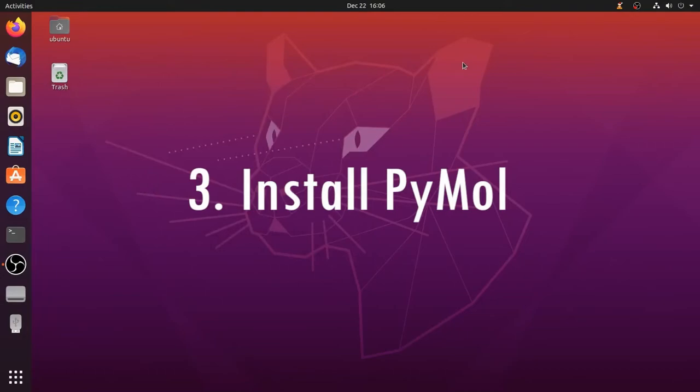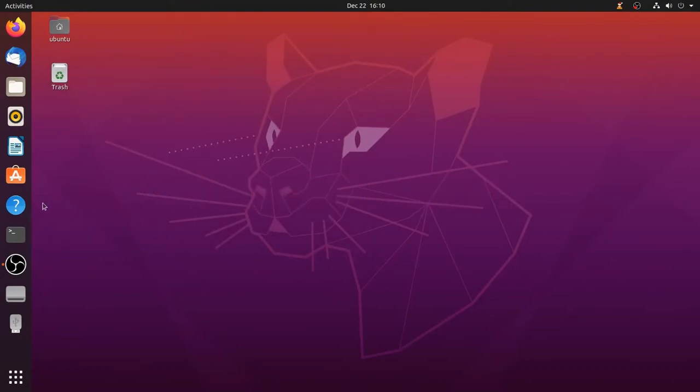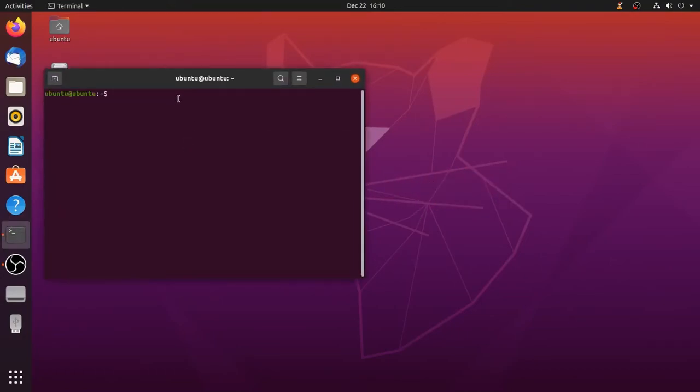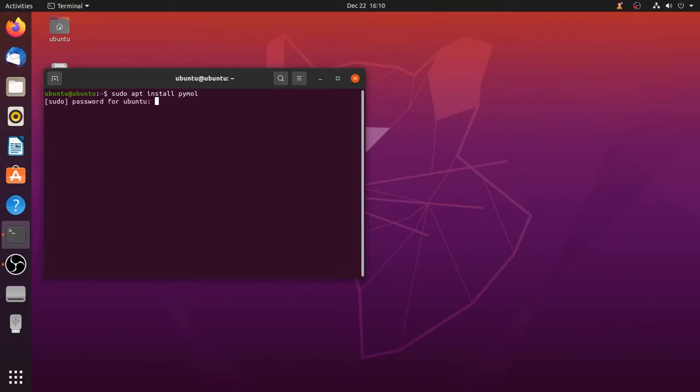Next we have to install PyMOL. To install this open the terminal by pressing Ctrl Alt T and type sudo apt install pymol. It will ask for password so type in the password and press enter.